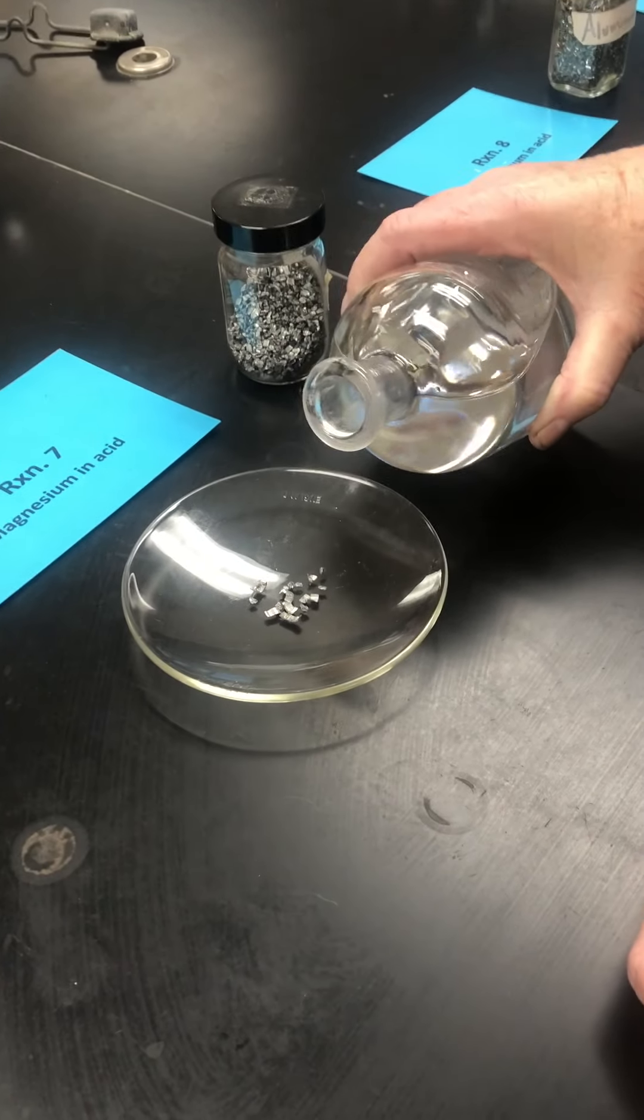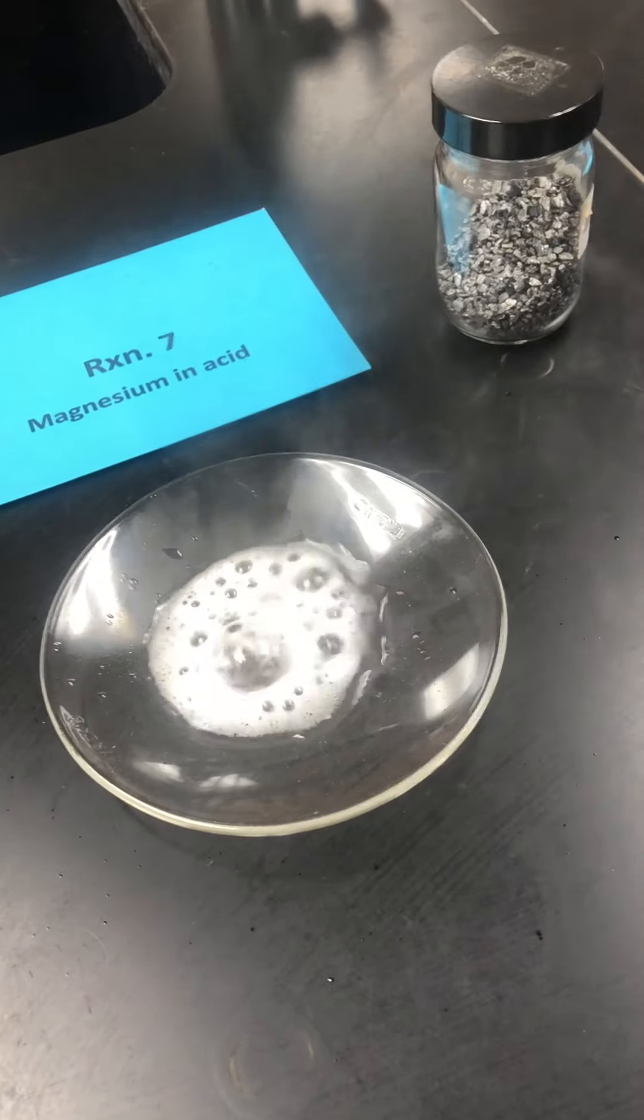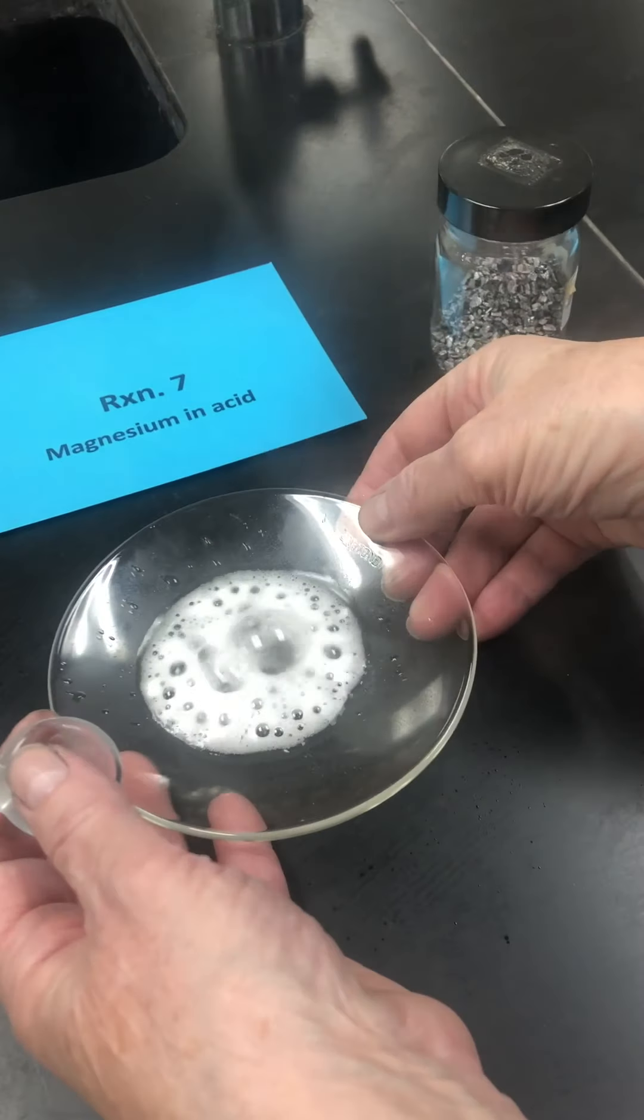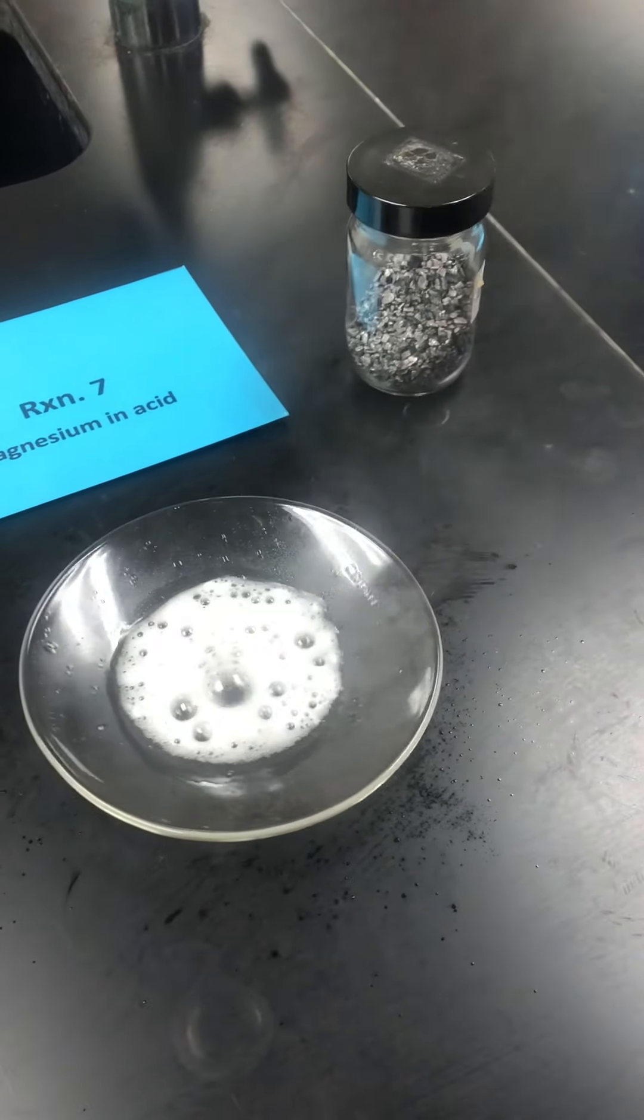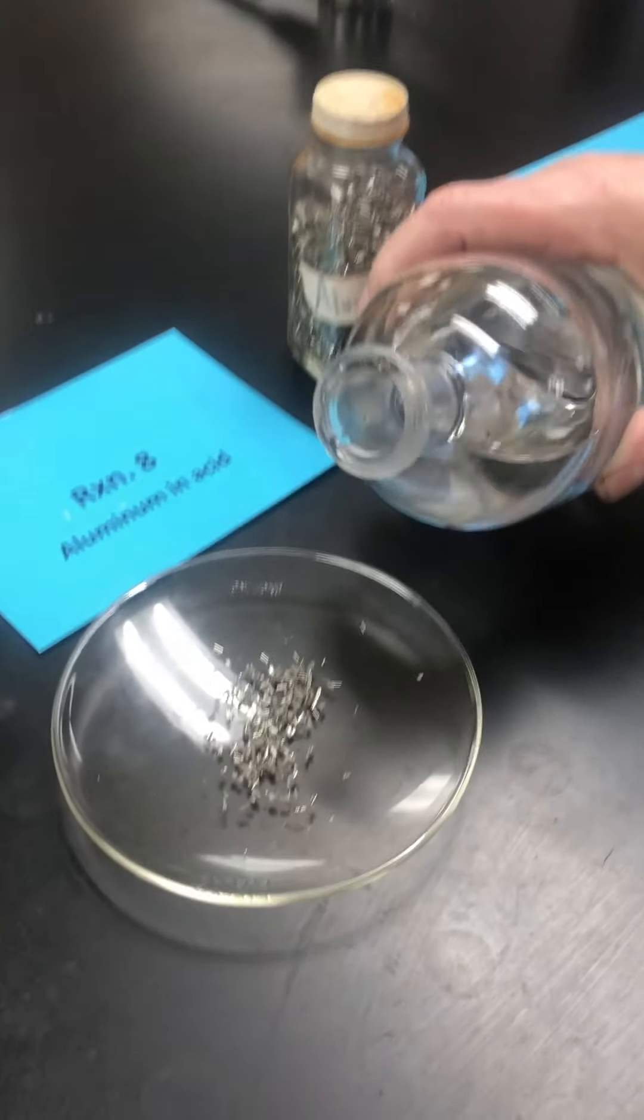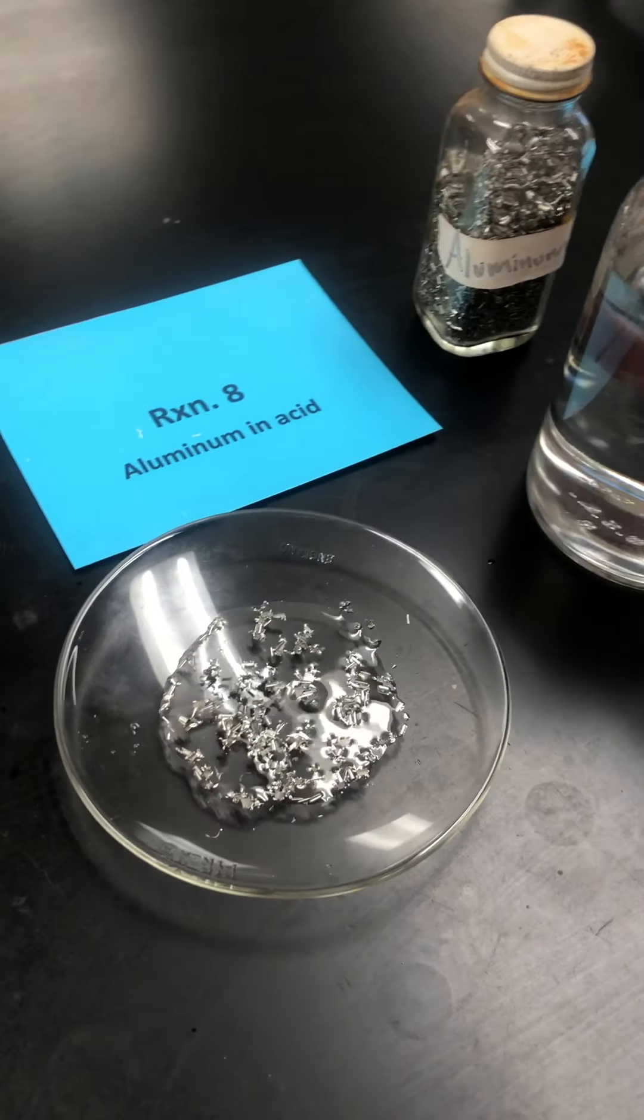Here is the hydrochloric acid added to the magnesium, and I might say this is very warm. Here is the hydrochloric acid added to the aluminum. Now I'm going to come back to this one in just a minute.